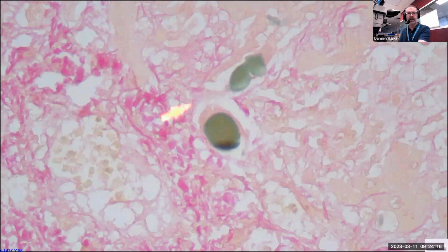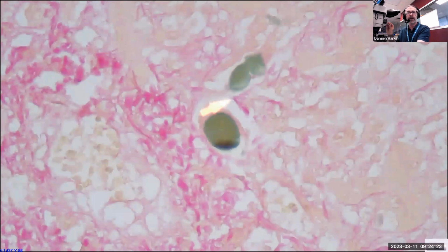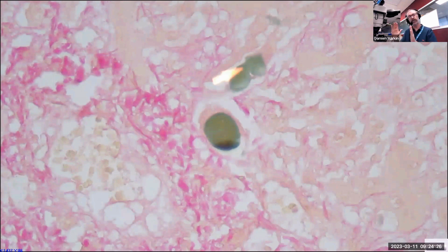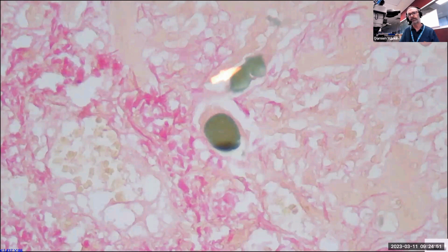And as you can see, it quite clearly, by virtue of this avocado green or olive green color there, is a diagnostic way of demonstrating that bile as being separate from other things, okay? So melanin won't do this, hemosiderin won't do this, but when you combine, as I said, the ferric chloride with the trichloroacetic acid, and again, I'll provide the full details in subsequent videos, you get that nice vibrant green color.